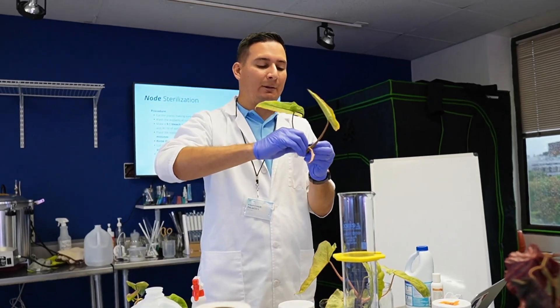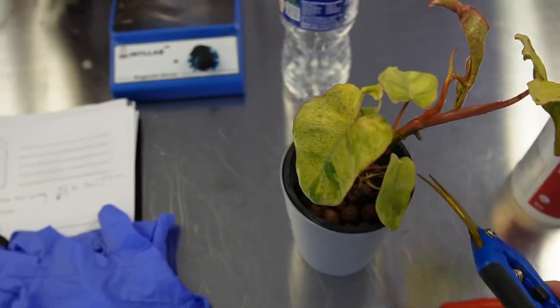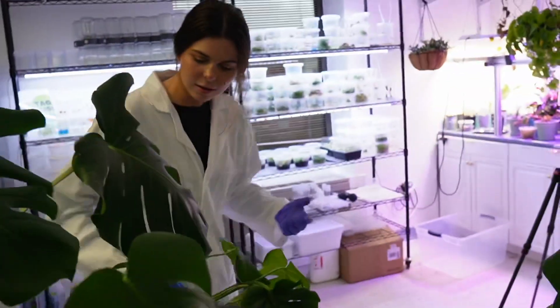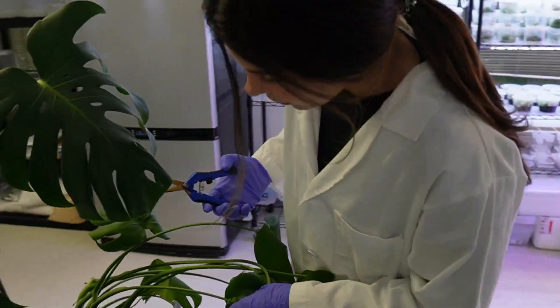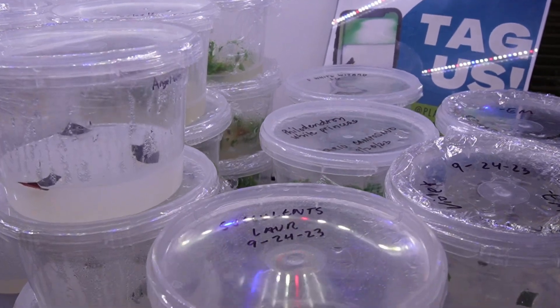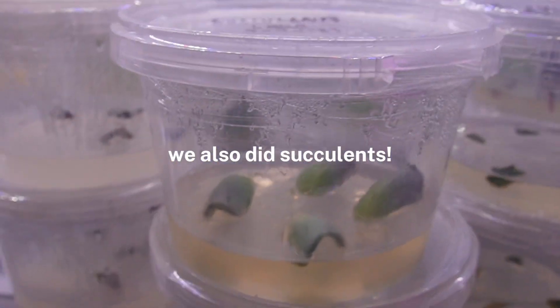After the begonias, we moved on to philodendrons and tissue cultured a philodendron parisoverde. And then after that, we also tissue cultured some monsteras. We basically spent the whole day cleaning different explants and putting them into tissue culture, so it was a great hands-on experience.